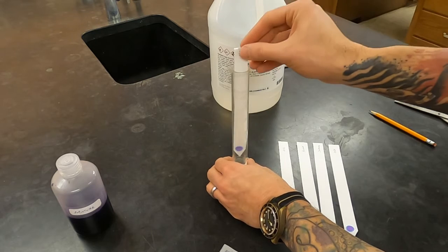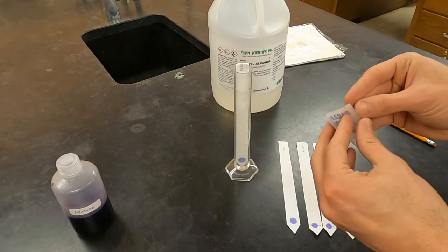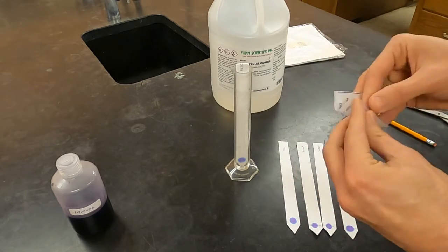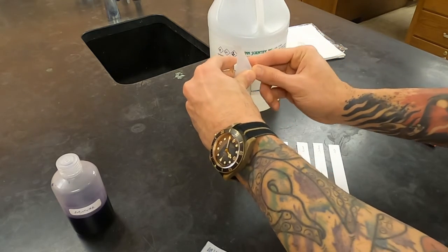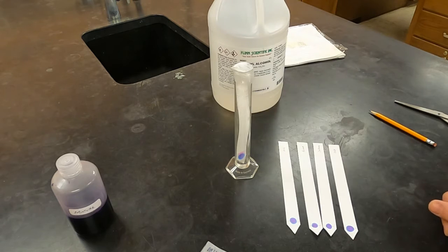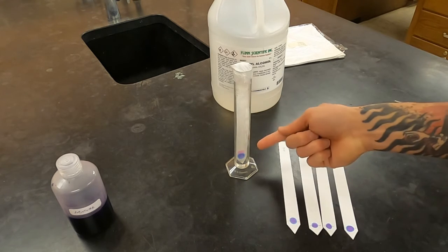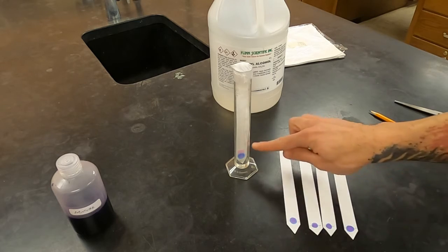Next, you put your paper back into the container so that it's touching the solvent. The solvents will evaporate, so you need to seal the top — that's what the parafilm is for. You separate the wax from the backing paper, hold it in one place with one finger, stretch it, and press it to seal. This doesn't have to be a perfect seal. You can see already that the solvent is moving up and is separating the red from the blue. As this is going, you'll want to keep an eye on it because you don't want the solvent front to go past the edge of the paper.